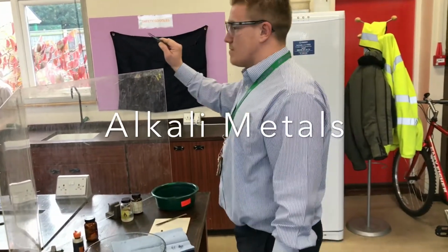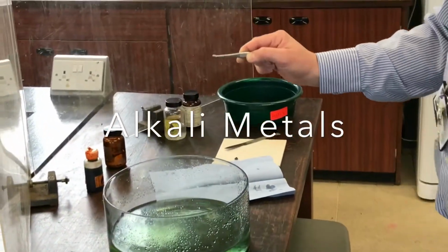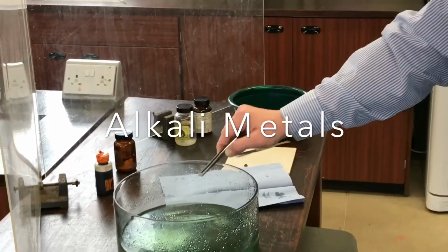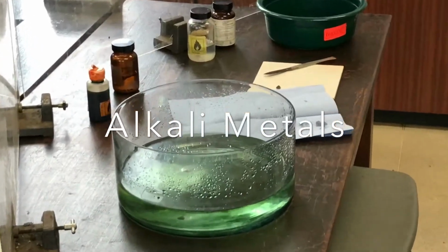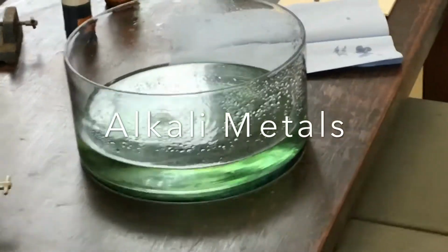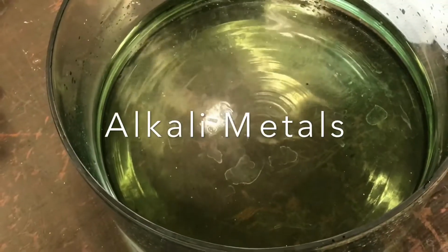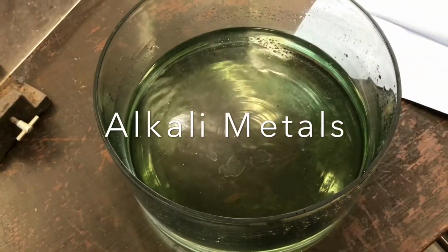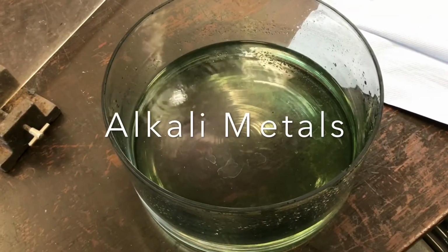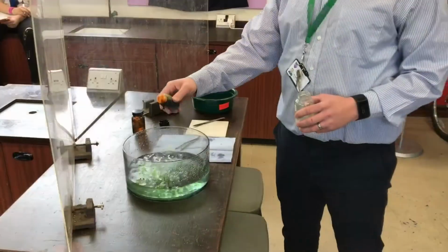Are you ready for this? Okay, we're going to go for reaction in water of lithium in 3, 2, 1, go. And we have a fizz. We have some gas and some bubbling going on. And it's moving. Gas coming in here. Yeah, there is some gas for that.